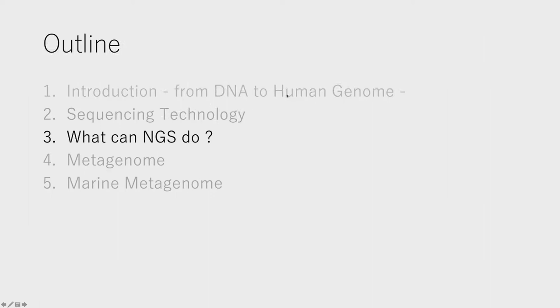I'll start. Okay, I have explained how the nucleotide sequence can be determined. Next, I'll speak about how the next generation sequencers can be used. As I told, the next generation sequencer is a game changer and the driving force of current molecular life sciences. But it is just a sequencer. Why has the next generation sequencer become a game changer or driving force? So I'd like to speak about it.